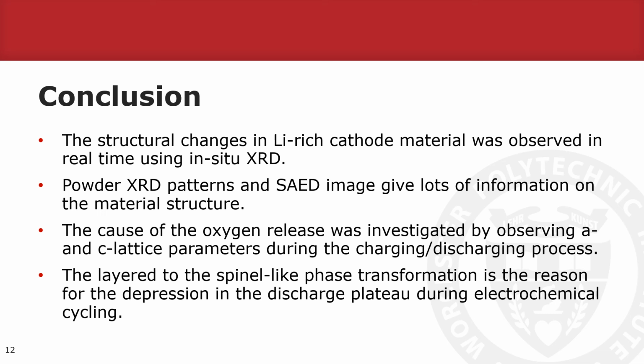The cause of the oxygen release was investigated by observing a and c lattice parameters during the charging-discharging process. The layered to spinel-like phase transformation is the major reason for the depression in the discharge plateau during electrochemical cycling.